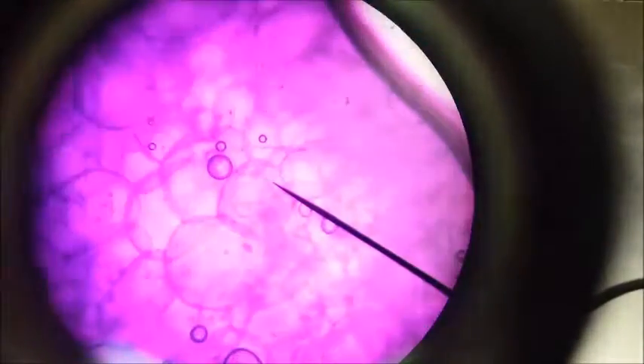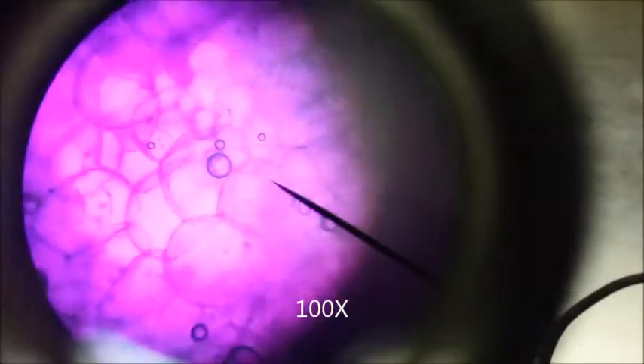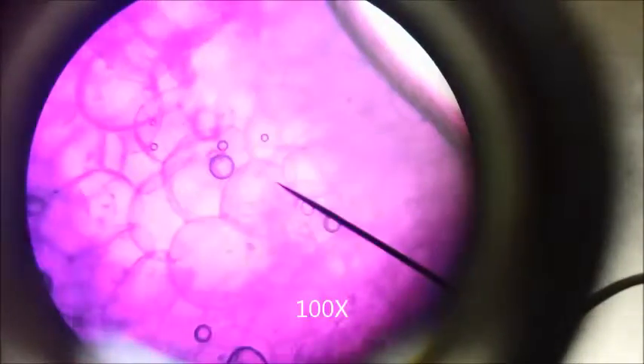This is 10 times 10 — 10x magnification. Once again, some really nice cells and pretty beautiful nuclei.